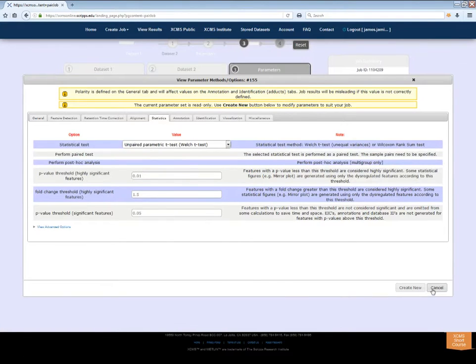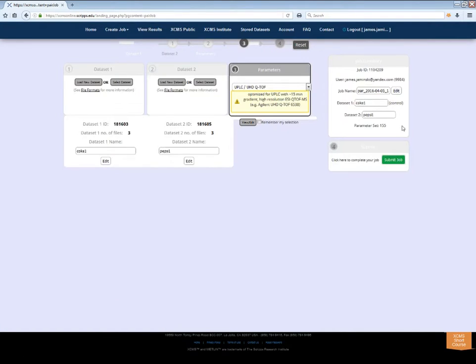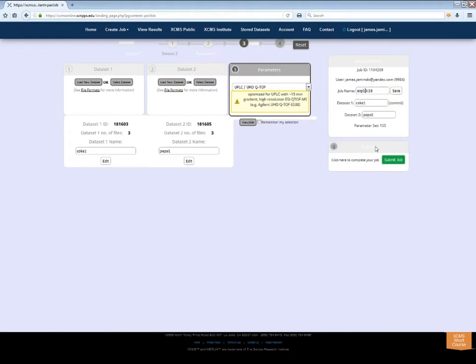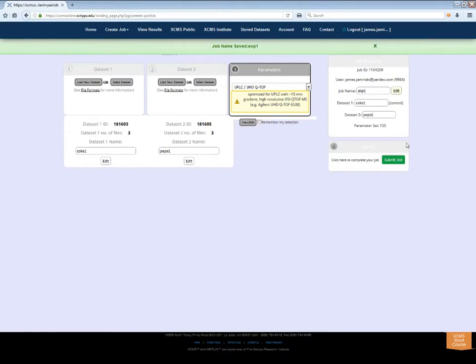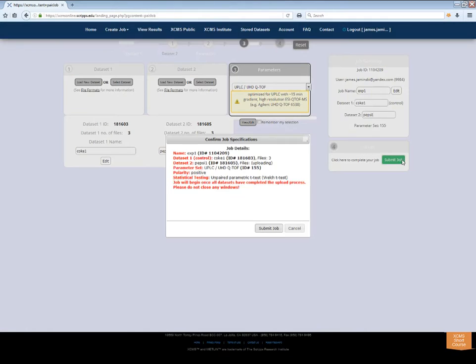Finally, check the job summary. XCMS Online generates a generic job name based on the experiment type and date. Click the Edit button if you want to change this, then click Save. Now, click the green Submit Job button in Step 4.